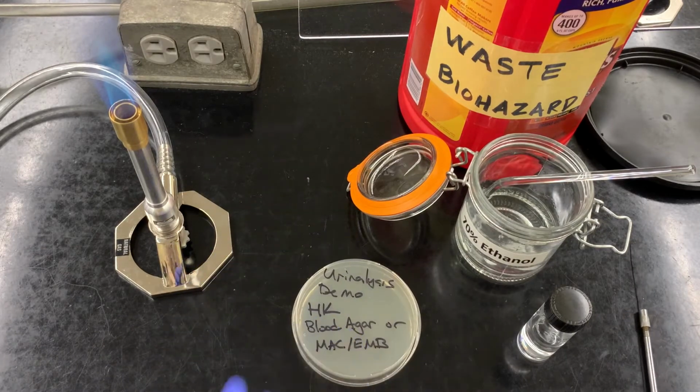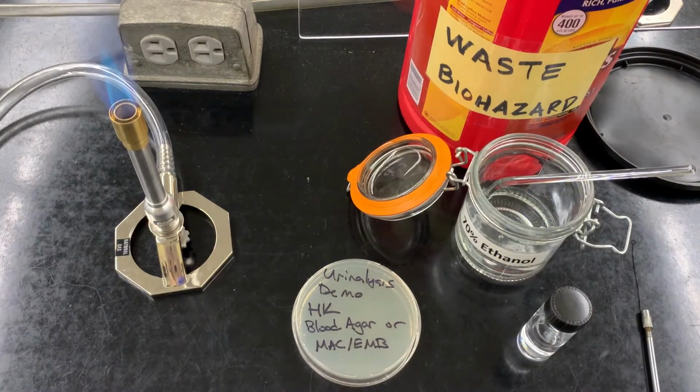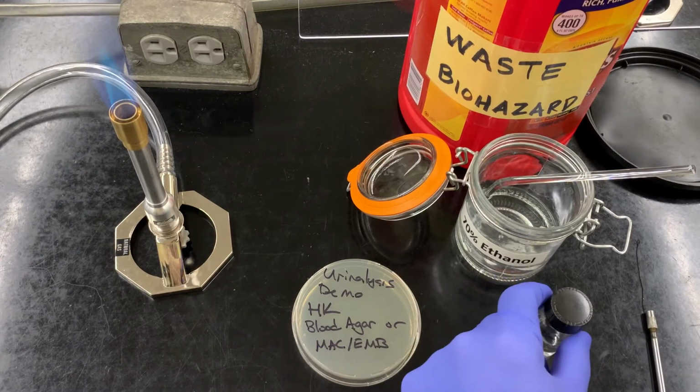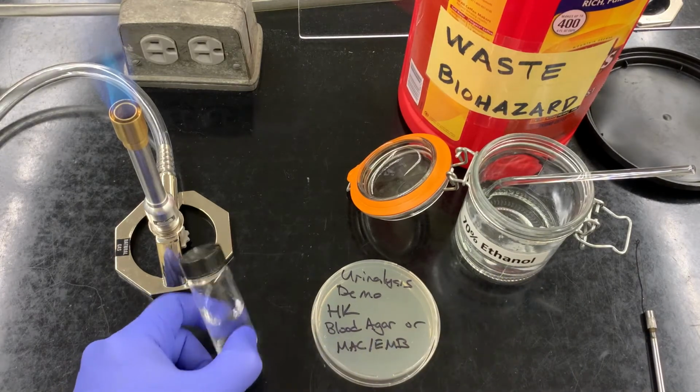For urinalysis, again, we will have two media, a blood agar, right? Probably TSA, and then MacConkey or EMB. We will have some urine for you to goof around with, but today I'm just going to use water.